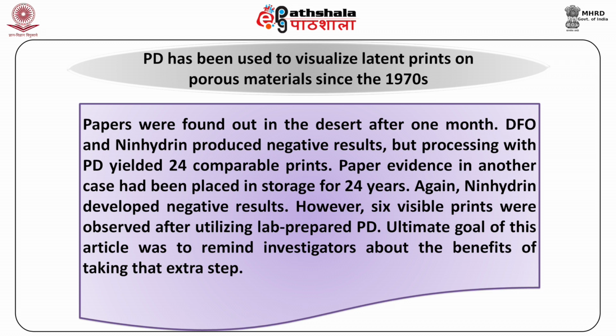Paper evidence in another case had been placed in storage for 24 years. Again, ninhydrin developed negative results. However, 6 visible prints were observed after utilizing lab prepared physical developer.